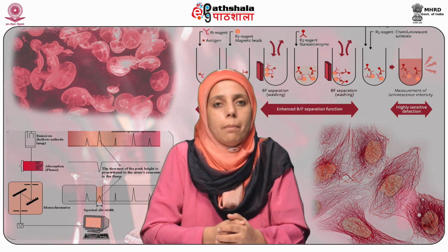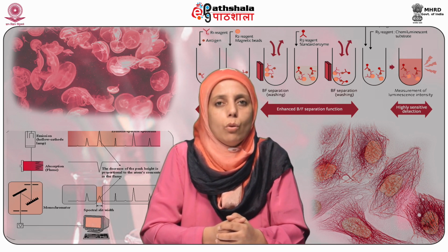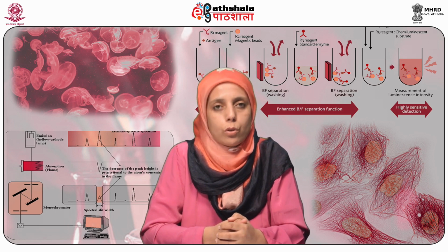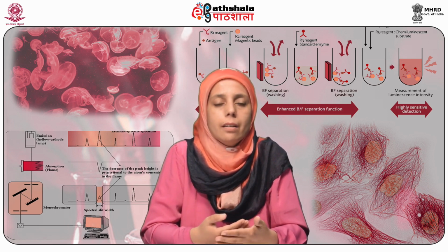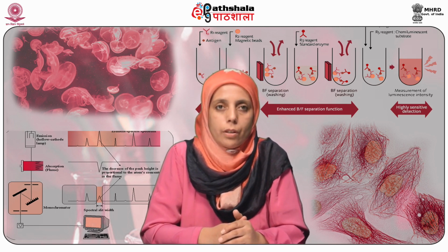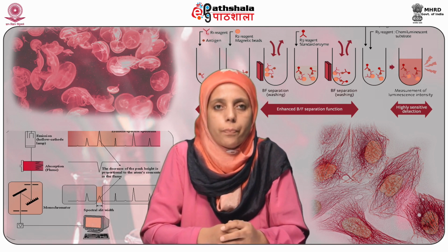The continuum lamps like deuterium and quartz iodine sources have too low intensity. As a result, fluorescence intensity will also be low, because it is the amount of energy you supply, you will receive the same amount of energy in emission. So therefore, it is important that you have a light source which has high intensity.